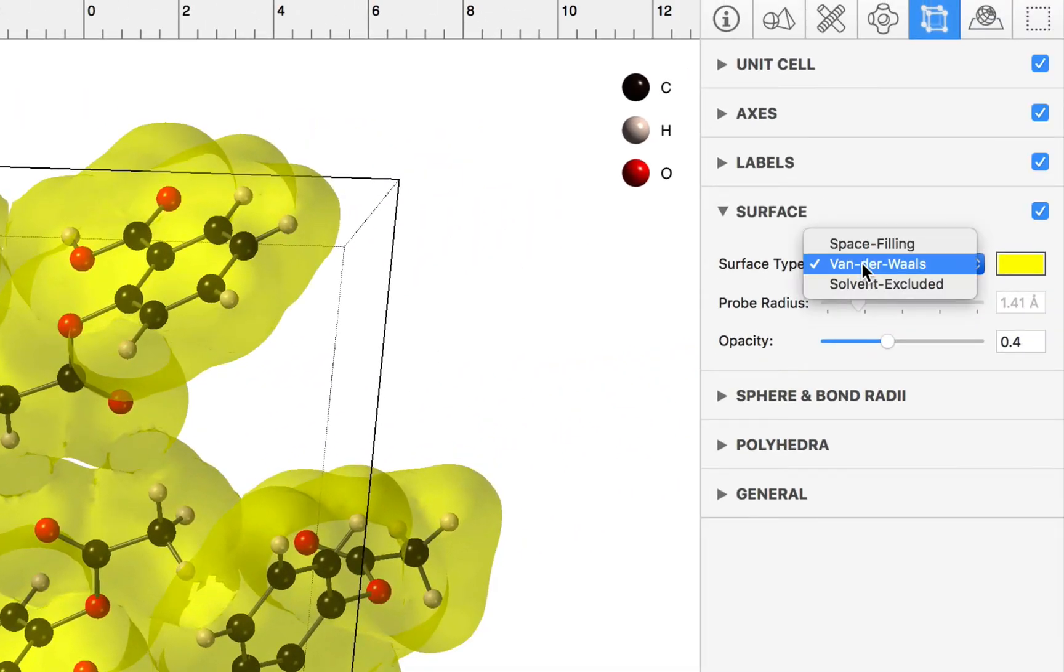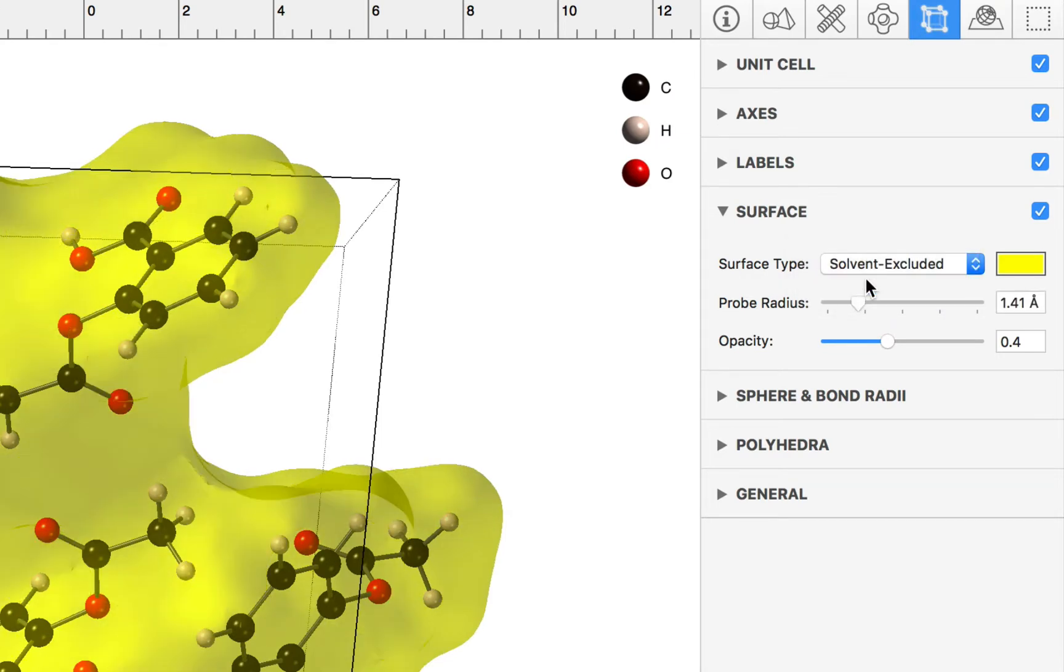We might want to change that to a solvent excluded surface, and we can customize the opacity and probe radius.